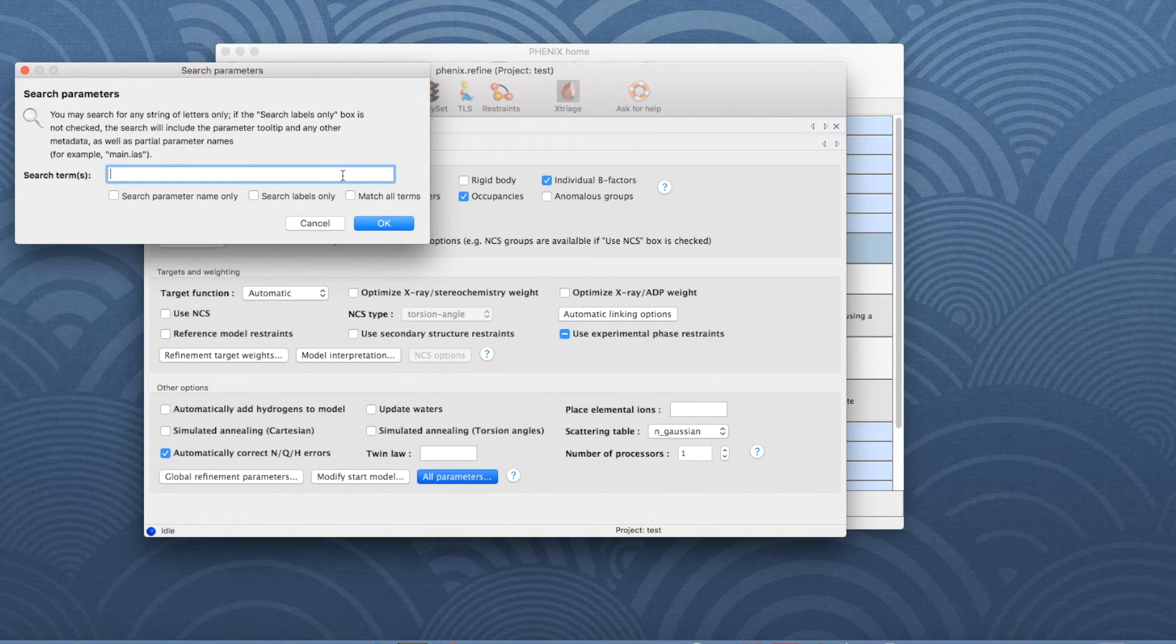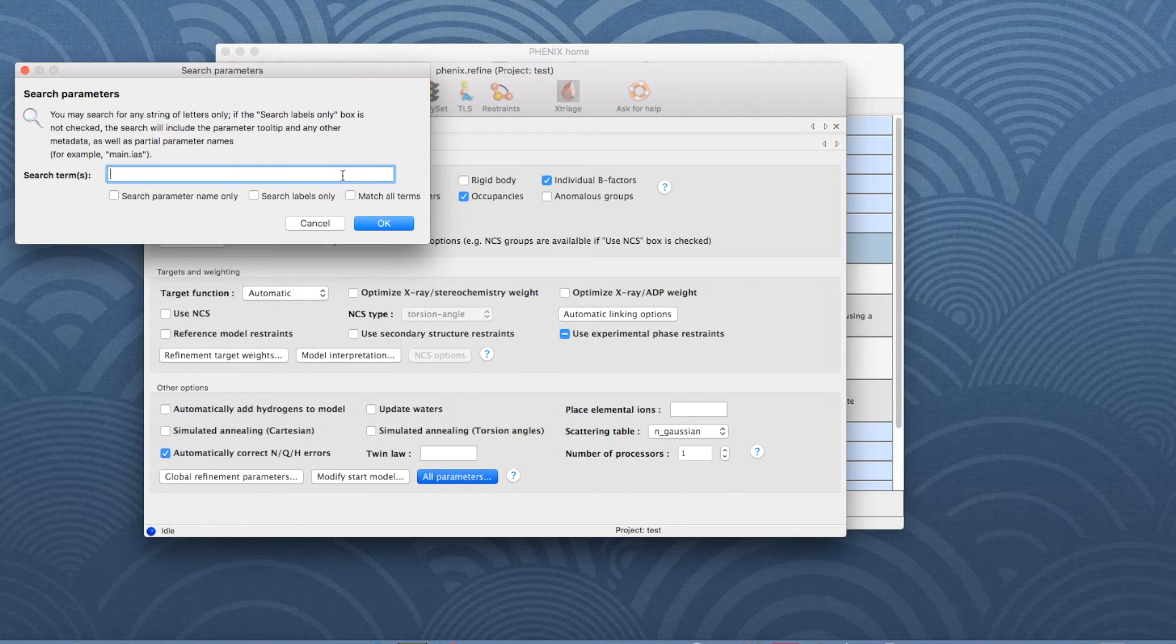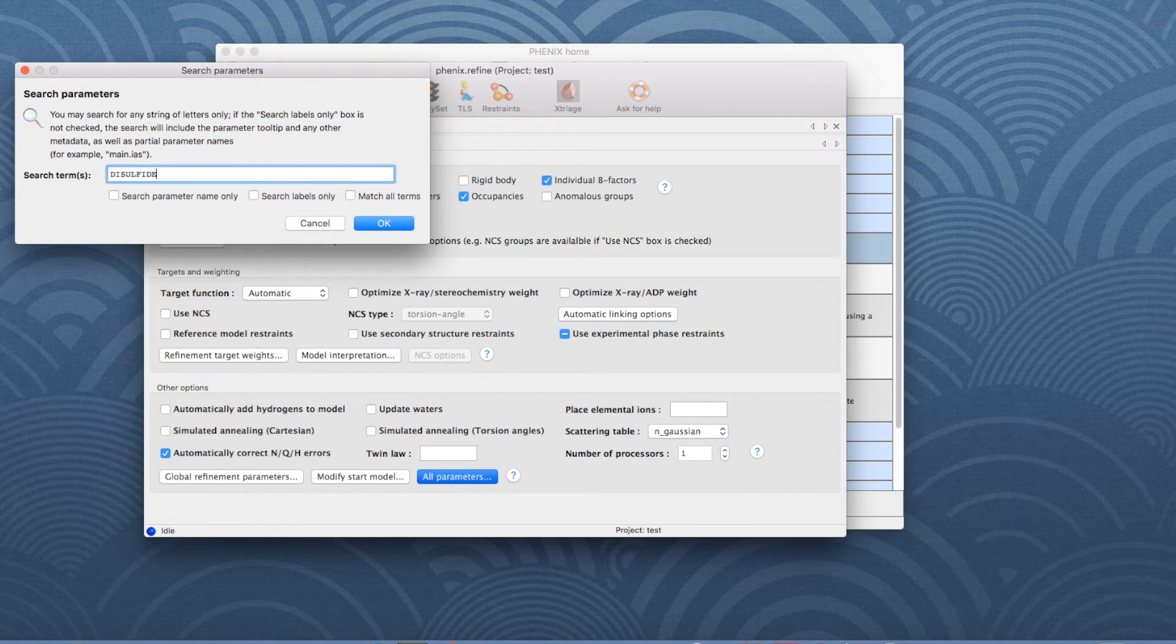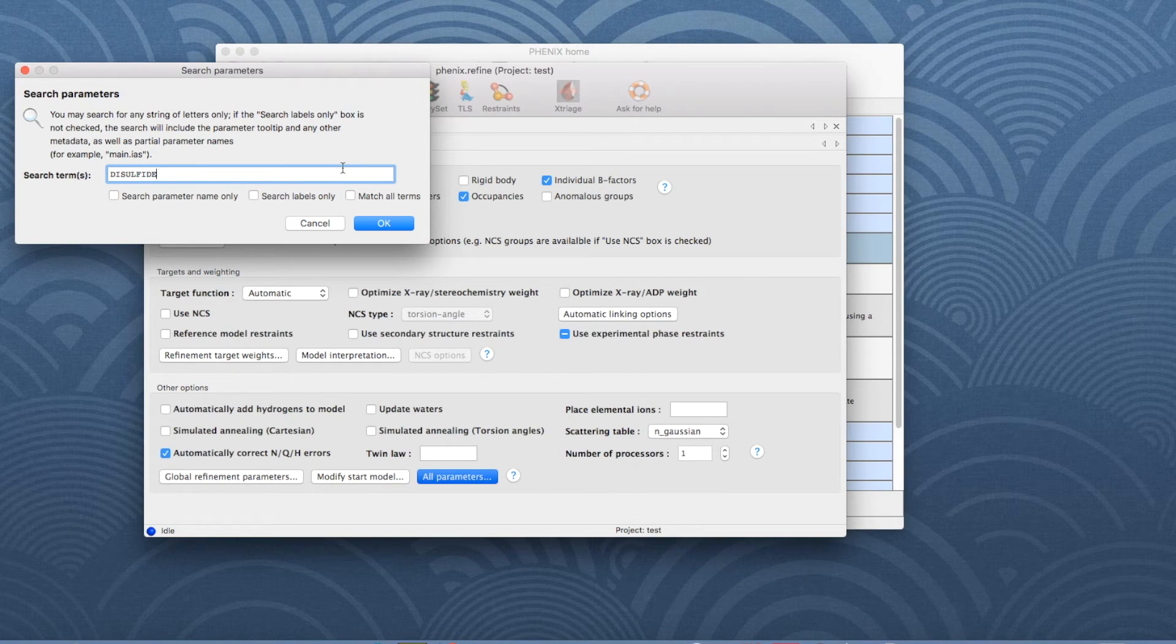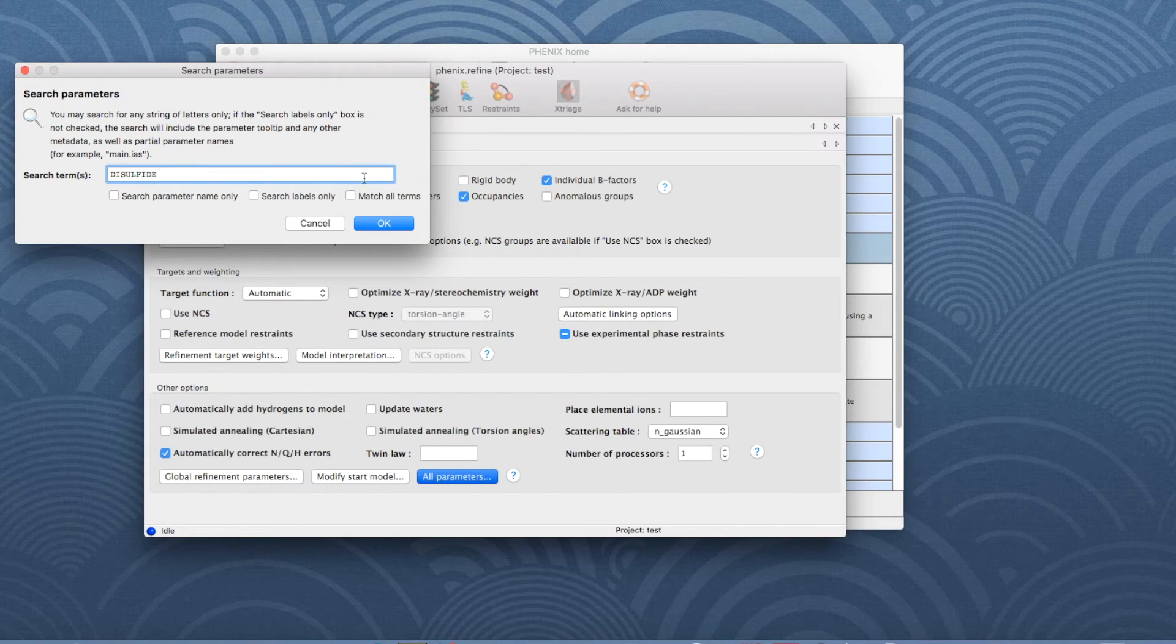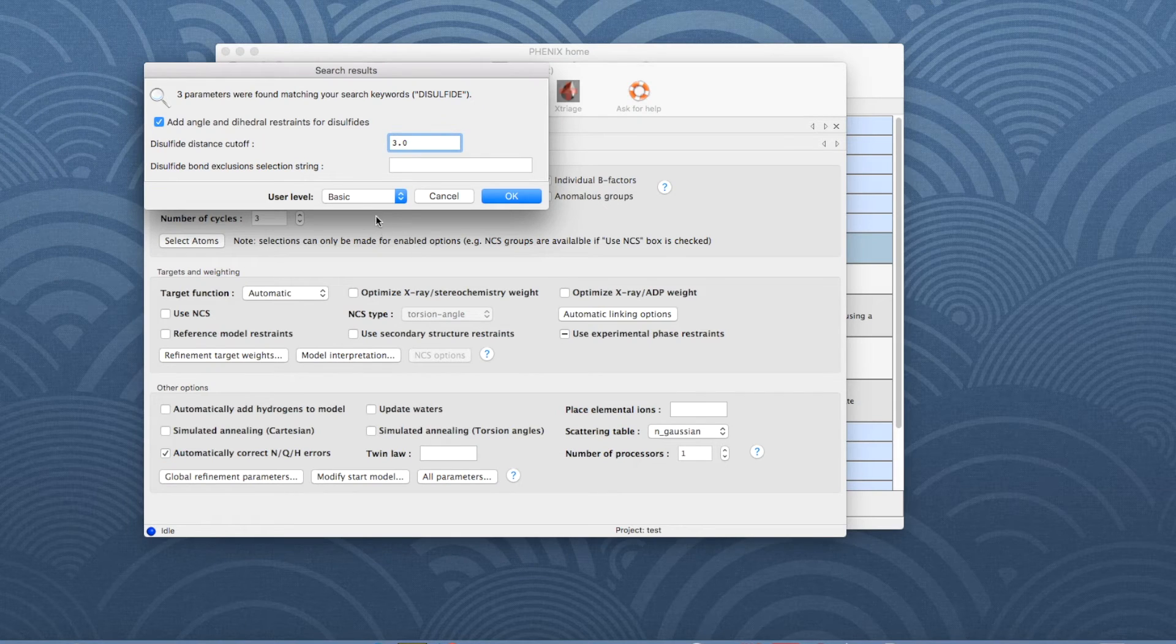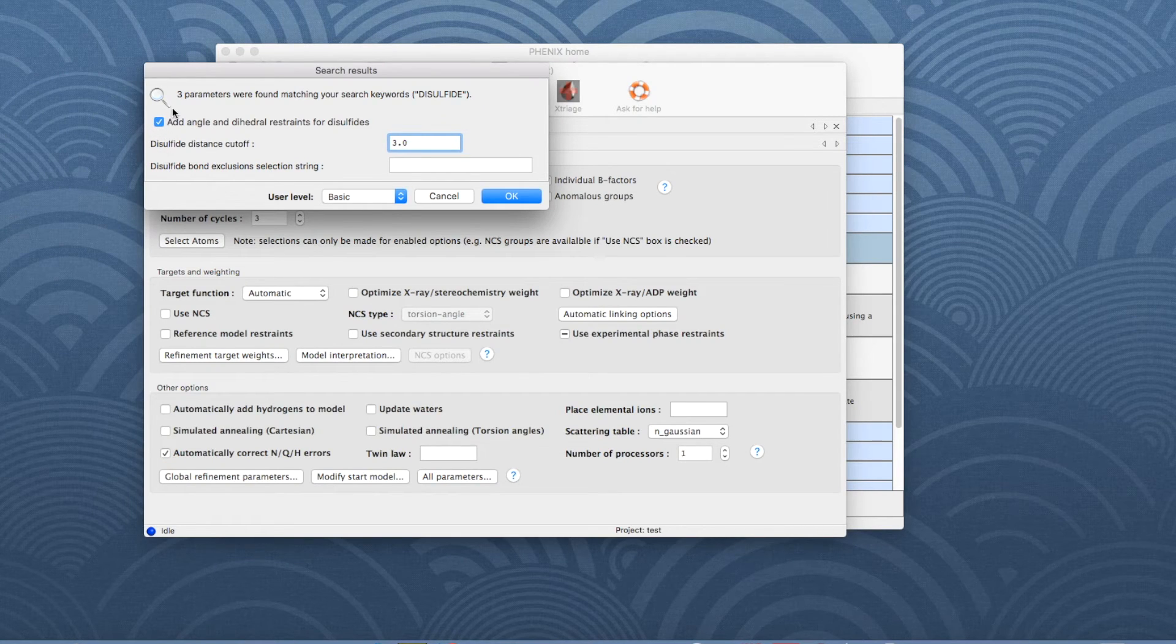Then type in the name of the parameter. You can type in either the complete name or only part of it. It shouldn't matter if capital or lowercase letters are used. Click OK and all parameters matching the search string appear.